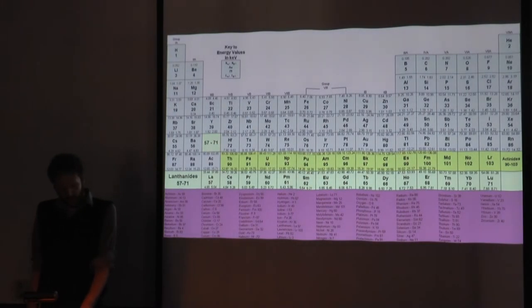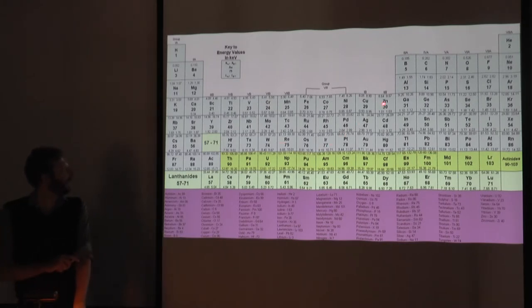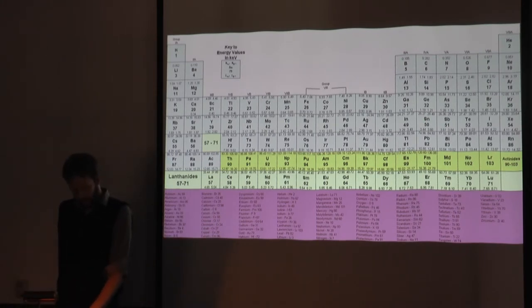As I mentioned earlier, whenever you use one of these pXRF spectrometers, you have to pre-program the energy of the photon and aim it at a specific group of elements. Bronze is usually composed of 9 parts copper and 1 part tin. Copper is Cu 29 and tin is 50. So these elements were the primary targets of our study.